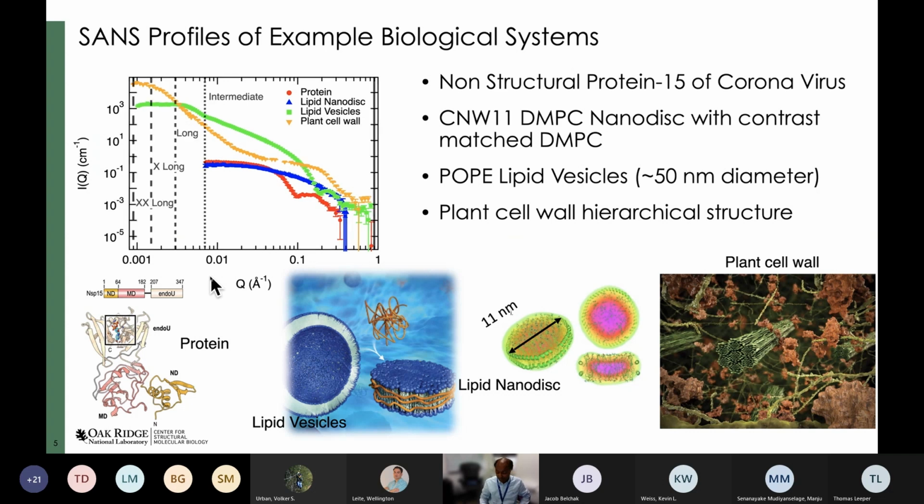And just to give a feel of how you make a decision. Let's say you already have some idea of your protein size, and you can do 1 by Q or 1 by R or some size, and you get a feel of where the Q sits. You can expect that the data will level off by 0.007, then you can say, well, the intermediate Q configuration should be enough because I don't need to go below.